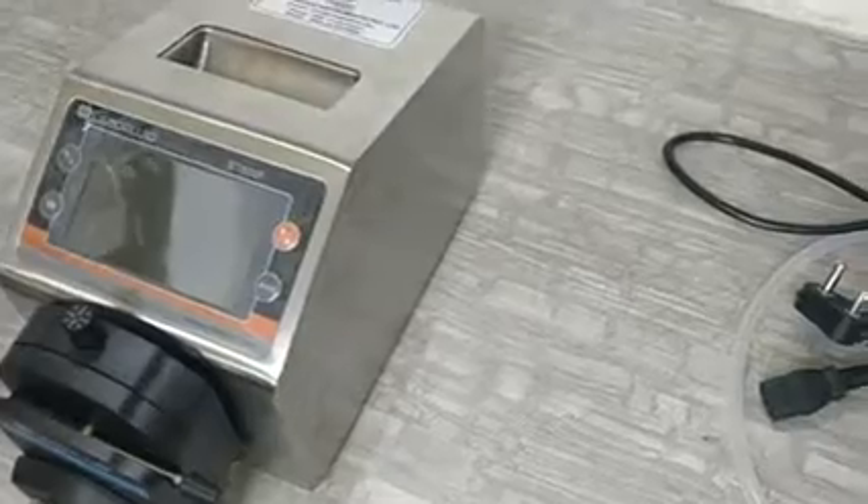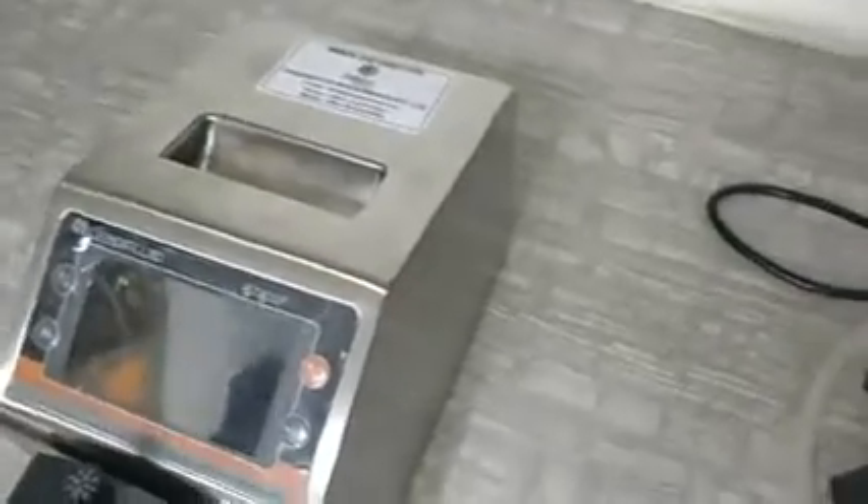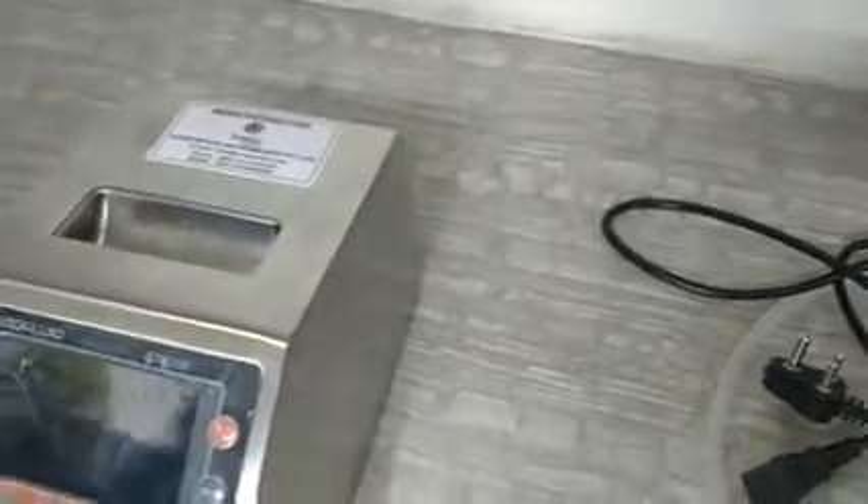As you can see, the complete body is stainless steel, so this is rust-free and you can easily clean it anytime. Still, we should always try to avoid spillage directly on the pump — that is always good for the health of the pump.